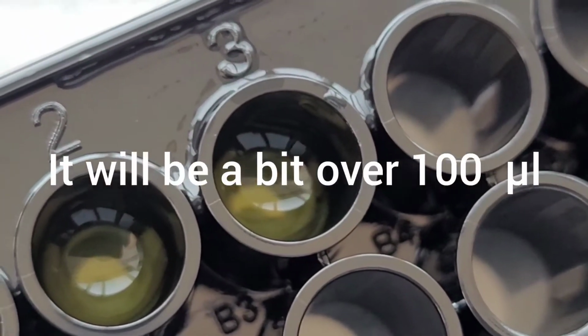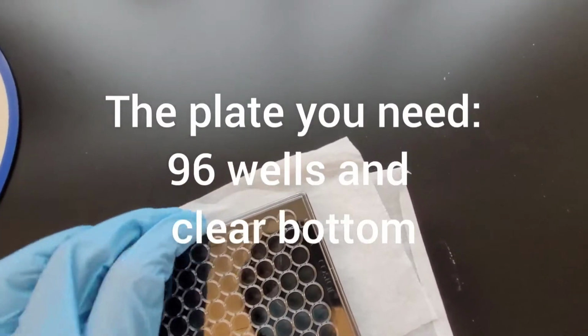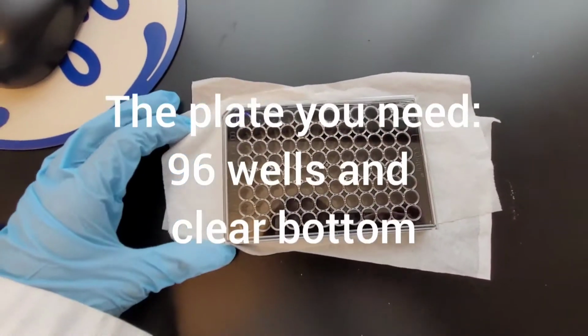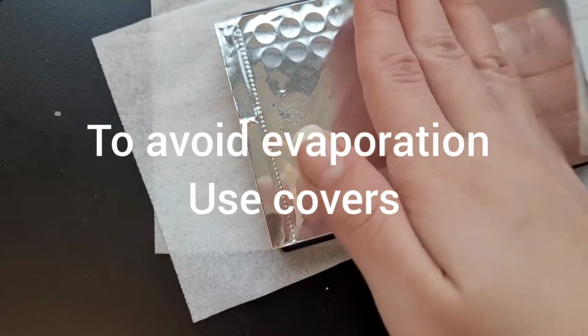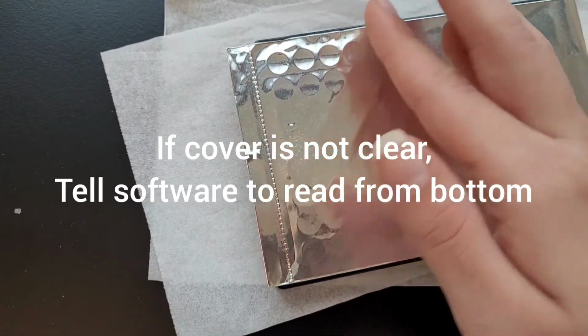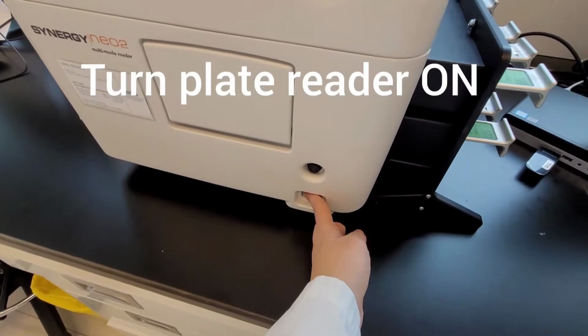And if you're working with just protein, usually I do 10 microliter of a 0.3 mg per ml solution, but you can try different concentrations if you want to test different conditions. And you can also add other ions or other things to see if it will affect the amyloid formation, so there is some flexibility there.